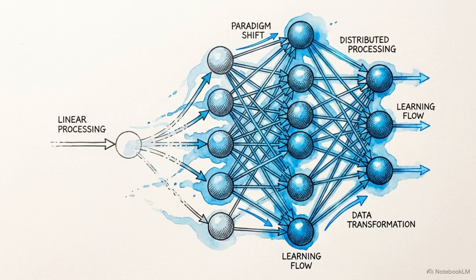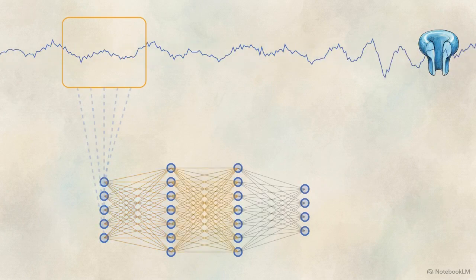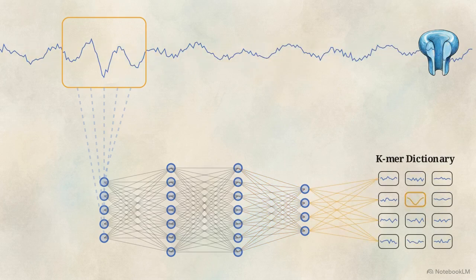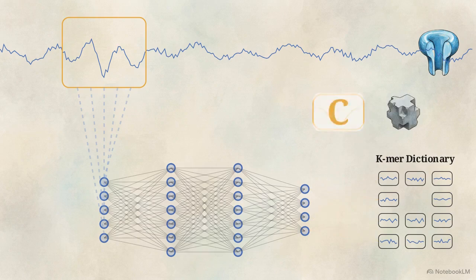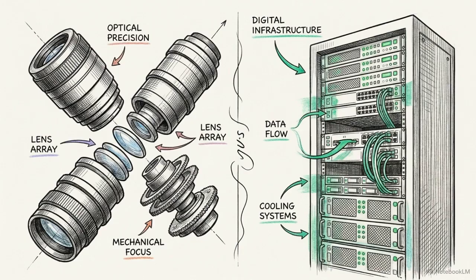Deciphering overlapping continuous multi-base patterns cannot be done efficiently with standard linear algorithms. The raw data routes to deep neural network base callers. These models execute context-dependent calling, mapping the live signal against the k-mer database and using surrounding sequence context to mathematically lock in the identity of the central base. Applying this algorithmic context drastically narrows the margin of error, pushing the base-called accuracy from the raw 85% up to 98 or 99%. Achieving high-fidelity nanopore sequencing is an equal split, half biophysics hardware, half advanced signal processing.